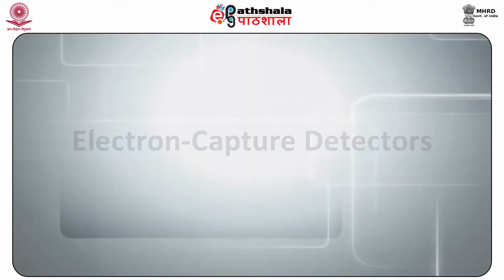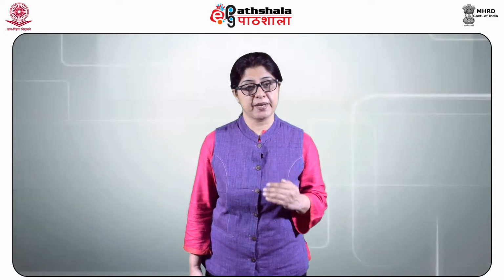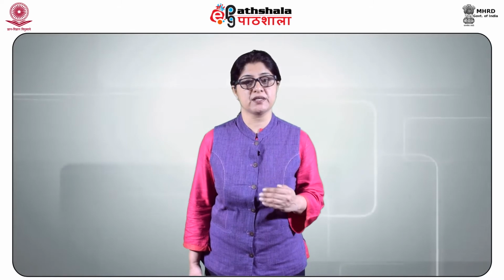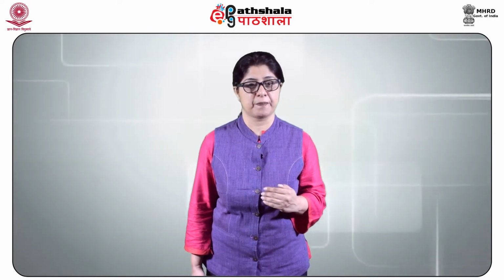Electron-Capture Detectors. Electron-Capture Detectors (ECD) are highly selective detectors frequently used for detecting environmental samples. The device selectively detects organic compounds with moieties such as halogens, peroxides, quinones and nitro groups and gives little or no response for all the other compounds. Therefore, this method is best matched for application when trace quantities of chemicals such as pesticides are to be detected and other chromatographic methods are unfeasible.